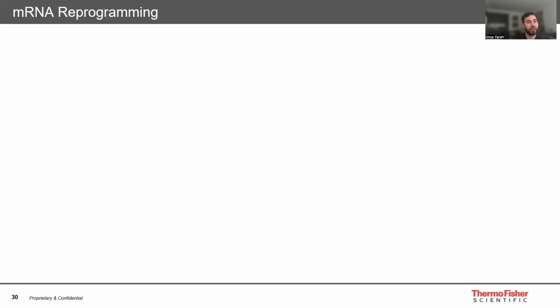If you remember those two factors that we rated all of the reprogramming methods around, safety and efficiency, mRNA would be at the top. Very safe. We're not using viruses or episomal vectors, but also can be quite efficient when employed correctly.